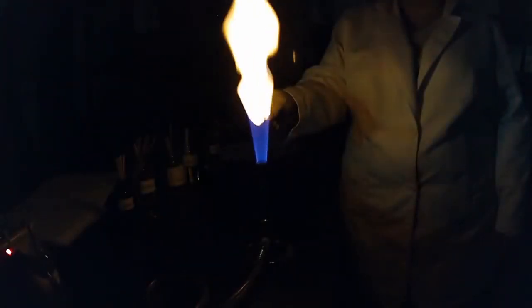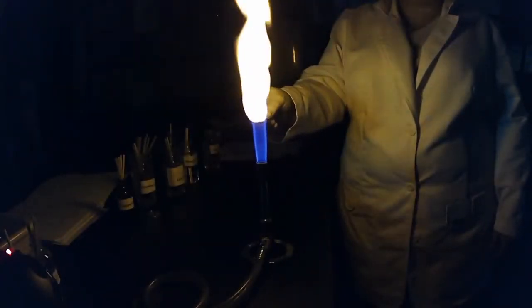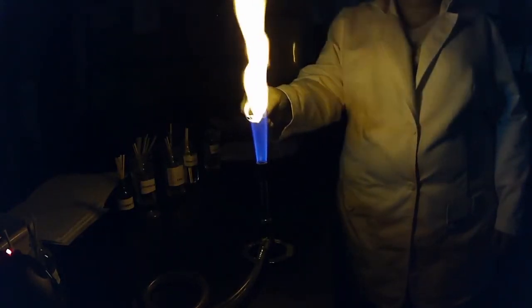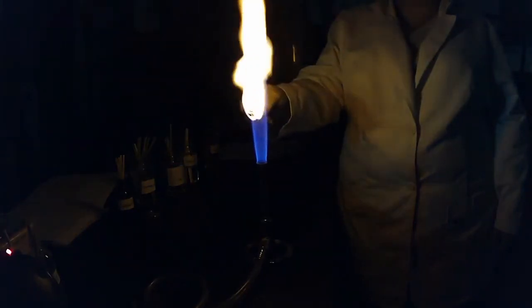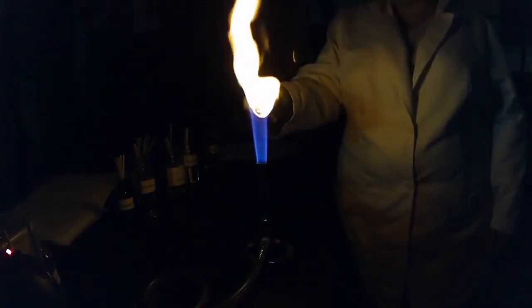Look at that yellow. Isn't that beautiful? It's a nice yellow. So sodium, when it excites its electrons, they go up, and the energy it puts off makes a yellow. On the EM spectrum, of course, we can see the wavelength and how much energy they absorb. So sodium is yellow. All right, so let's do our next one. We're going to move on to potassium here.